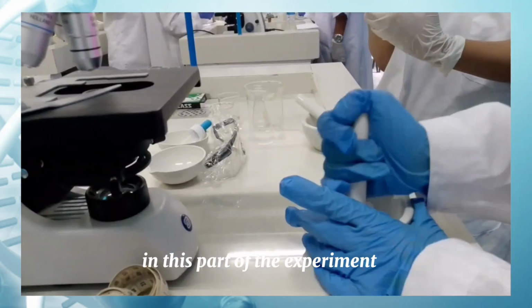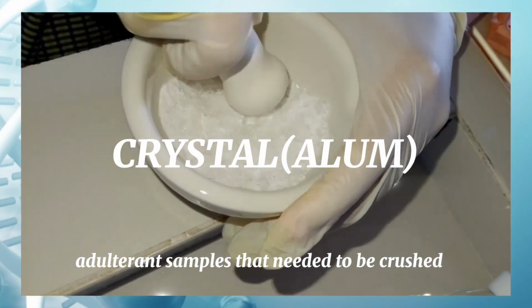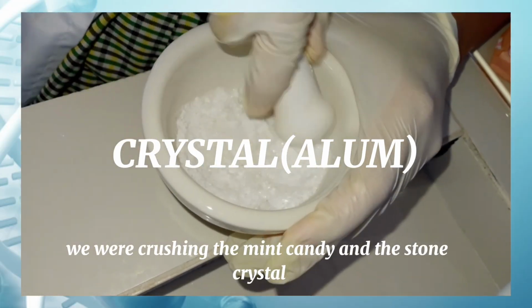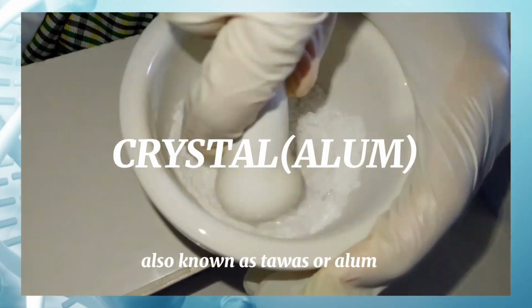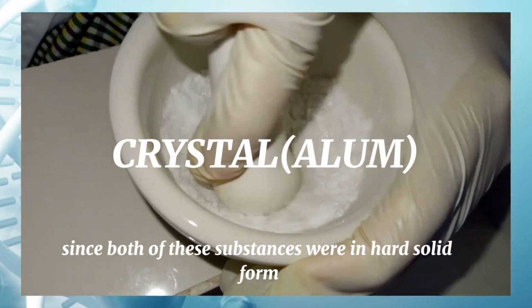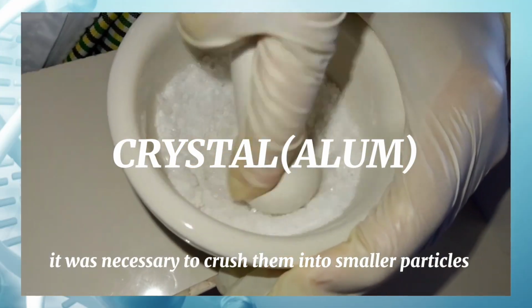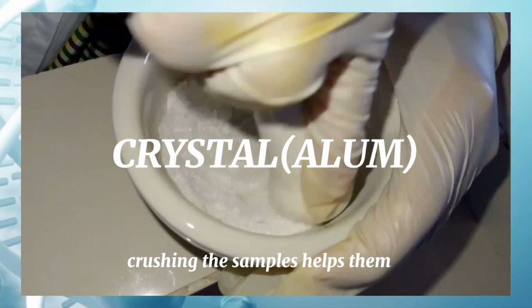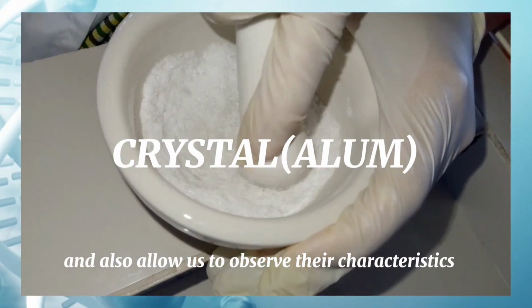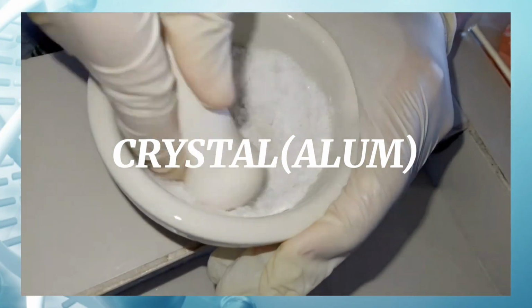In this part of the experiment, we prepared the solid adulterant samples that needed to be crushed before they could be used. In this video, we were crushing the mint candy and the stone crystal, also known as tawas or alum. Since both of the substances were in hard solid form, it was necessary to crush them into smaller particles. Crushing the samples makes them easier to mix with the different liquids and also allows us to observe their characteristics more clearly during the experiment.